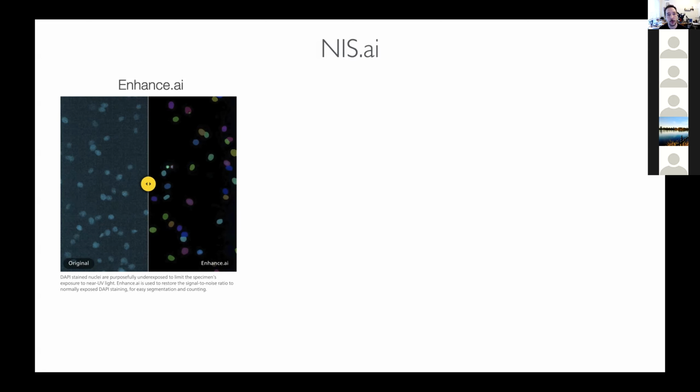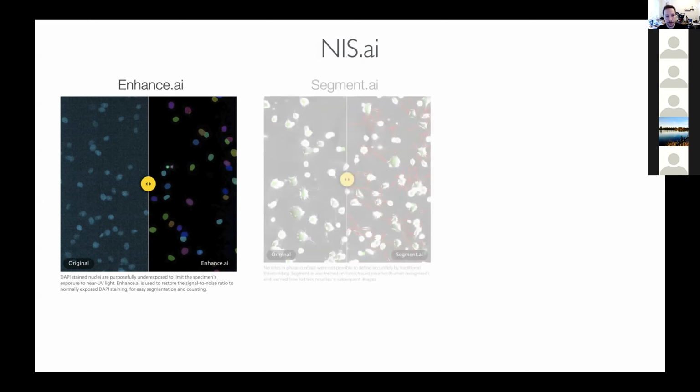The training involves taking paired data sets, one with very fast, noisy imaging and one with very slow, long exposure, high power images, so that we can train the network to interpret the noisy image and make something that's high contrast so that we can analyze that very easily. So that's one tool that we have.